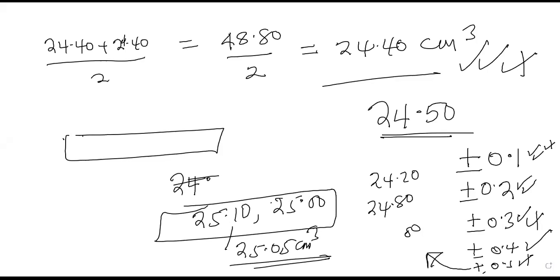Hope I'm clear. If I'm clear with you so far, type yes, because after getting the average, it means we go to how to calculate. There is no way I will teach you to be accurate. You be accurate practically. The first 2 titres can show you whether you are very accurate or not.